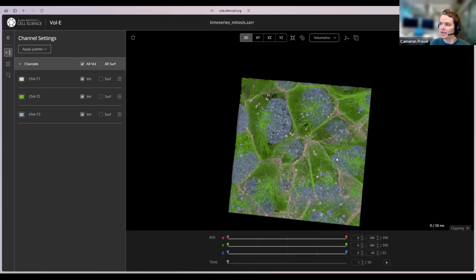So what that ends up meaning, workflow wise, is this is not something that can slot in right after image acquisition. Where it really shines for us is when those images have gone through a bit more of our data pipeline, especially when we're looking to compile these images into the large data sets that the Institute produces, of the kind that BFF is great at browsing. So these two apps really complement each other. That's the use case where our internal scientists use that tool.